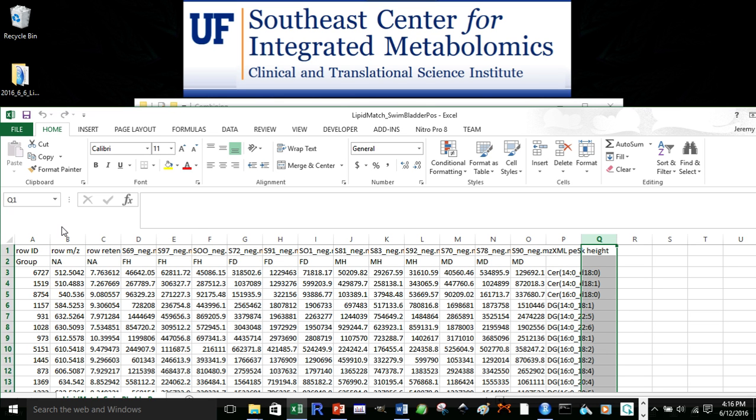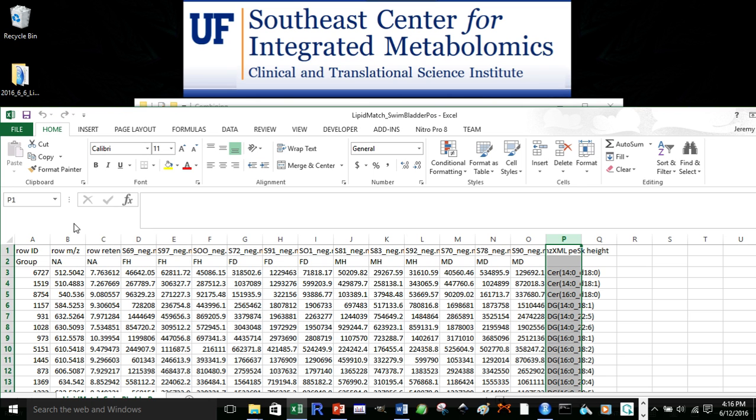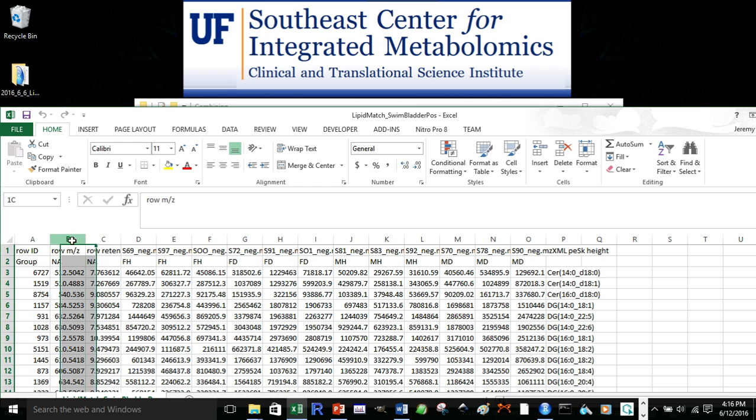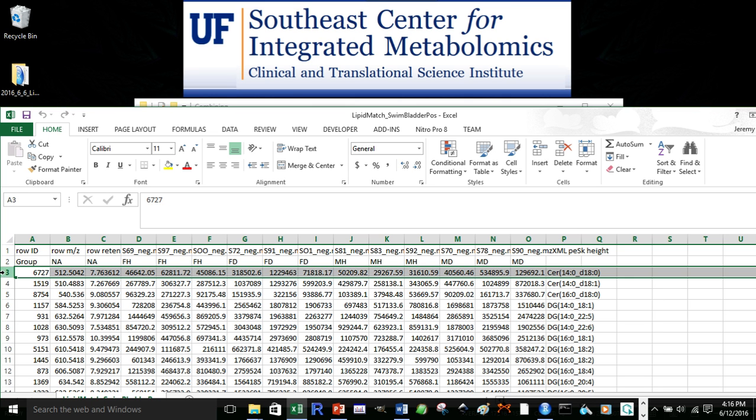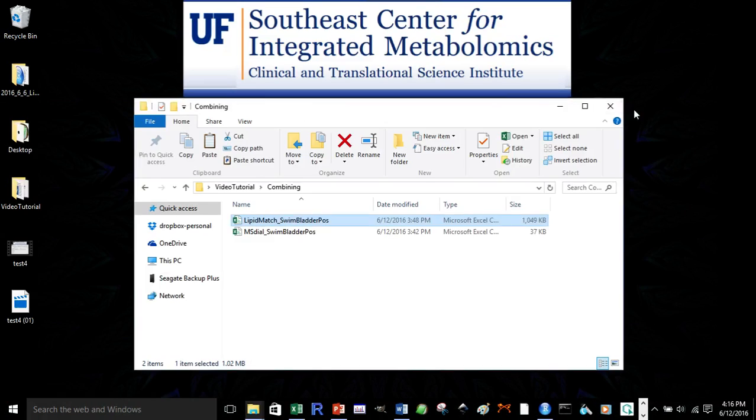In order to do that, the first thing we do is we take down some important information we'll need to run the software. That is, we'll need the identification column, so that's going to be column 16 over here. We're going to need our retention time column, which is going to be column 3, our mass of charge column, which is going to be column 2, and the row in which our data starts, which is going to be row 3. We'll write all of that information down, and then close the file.